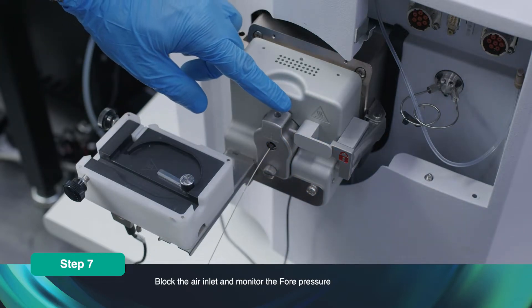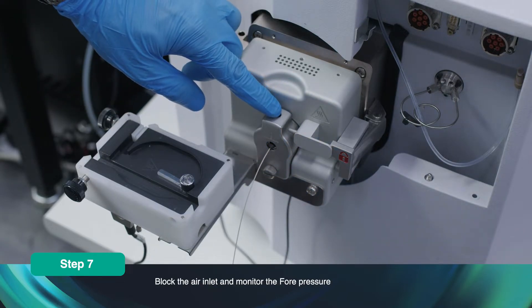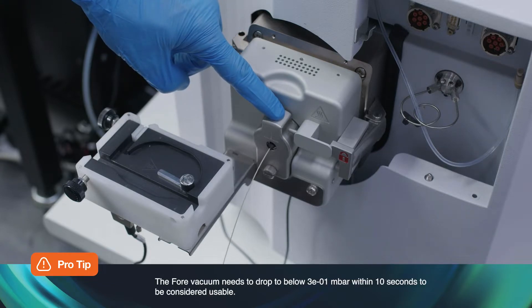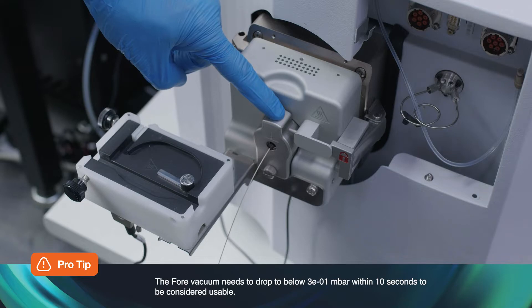Using a gloved finger, block the air inlet and monitor the fore pressure. The fore vacuum needs to drop to below 3E to the minus 1 millibar within 10 seconds to be considered usable. If it is not sealed, try refitting it before replacing the rubber seals.